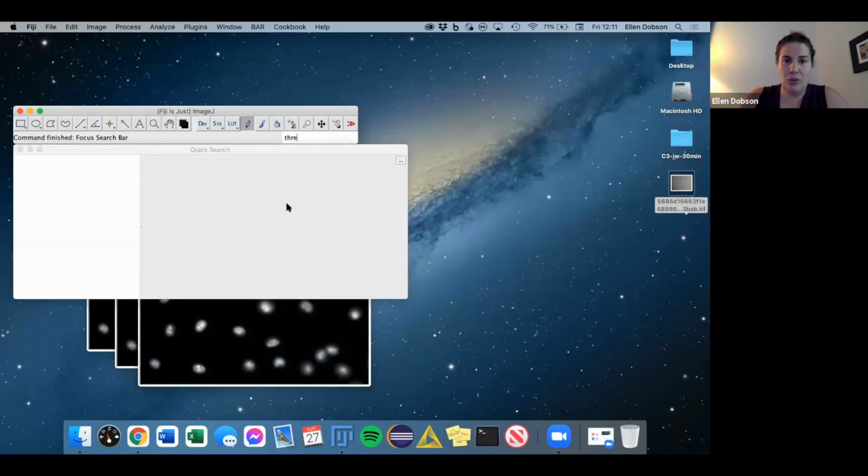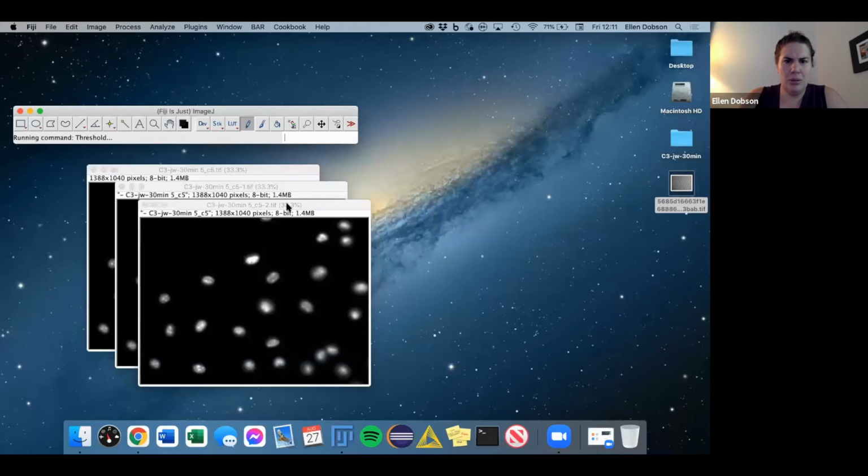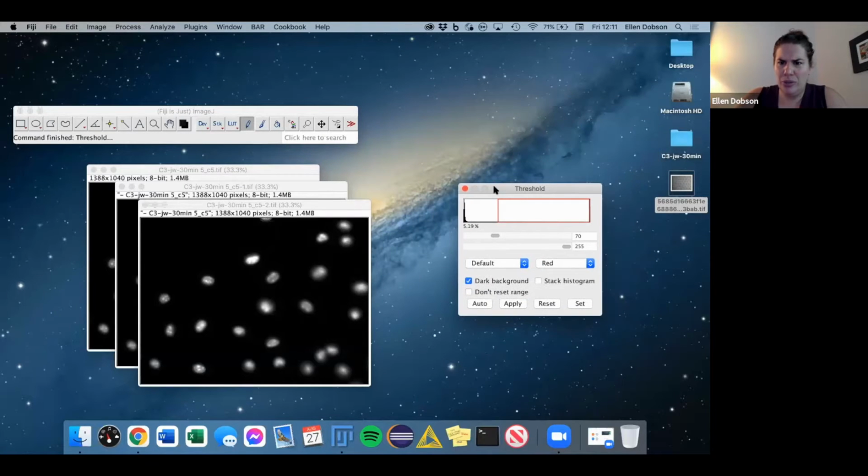So this guy we're going to threshold, and we're just going to use the auto again. And then from there, let's say, okay, we're happy with that selection. You can see the edges of these nuclei are a bit blurred out, but let's say we're mainly interested in measuring the intensity within. That should be fine. Again, the default method is based on Otsu, which is really good for nuclei segmentation, like I told you last week. So we find that threshold that we're happy with, preferably using automatic methods. And then right from here, we're going to create a mask.